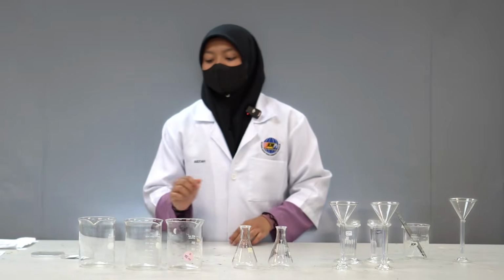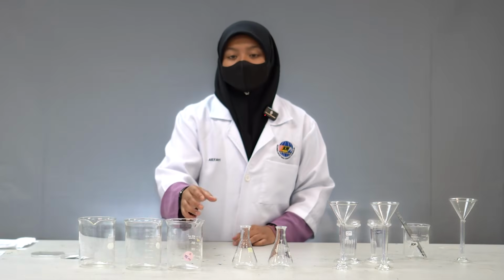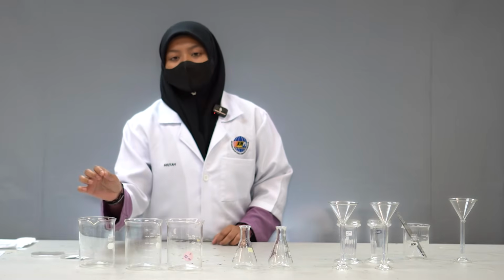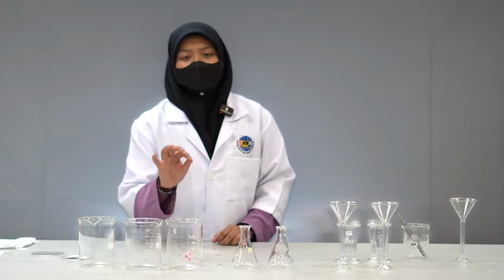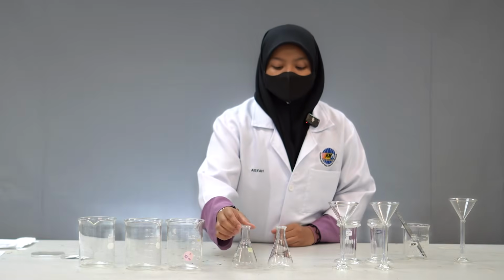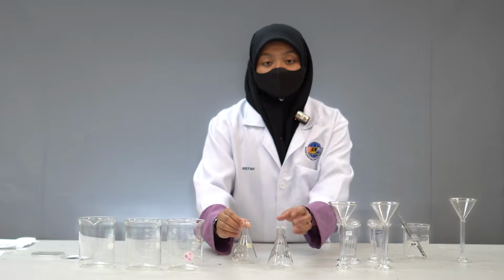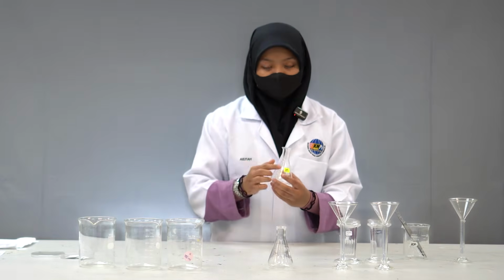Then we have 3 beakers, which are acid, base, and neutral. For these 3 beakers, we put DCM respectively in each. The amount you can only approximate, okay? Then we move to the flasks, and we take 2 flasks here. For the first one, as Sister Amani said, we must label.